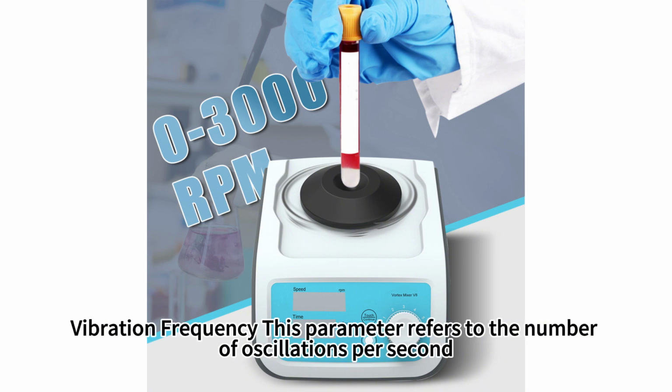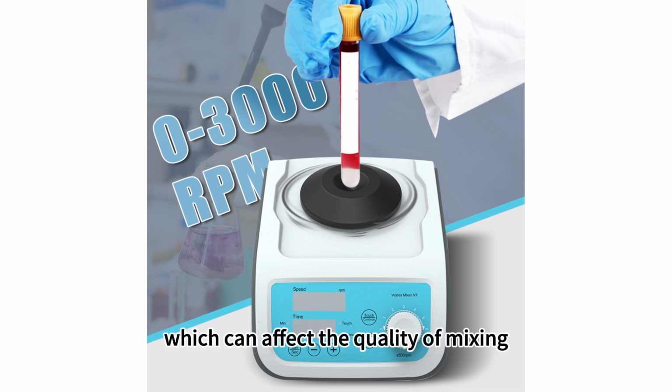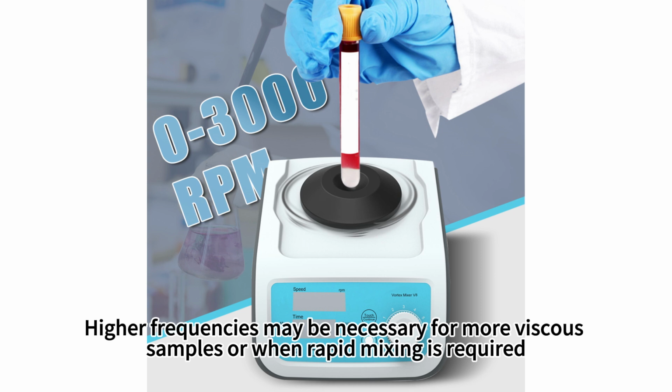Vibration frequency. This parameter refers to the number of oscillations per second, which can affect the quality of mixing. Higher frequencies may be necessary for more viscous samples, or when rapid mixing is required.